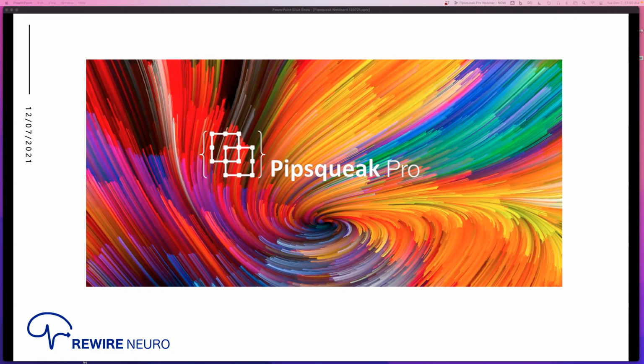Oh, cool. So you I can feel like, what is the Zoom now? That's a great intro, actually. That's perfect. Then you should do that on purpose. This is cell counting software, yeah.